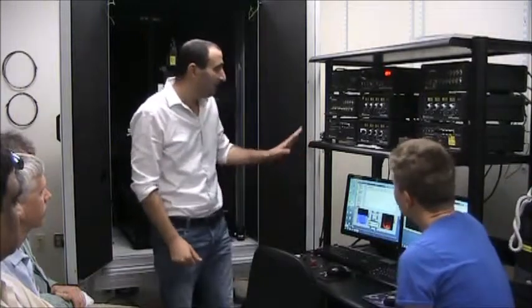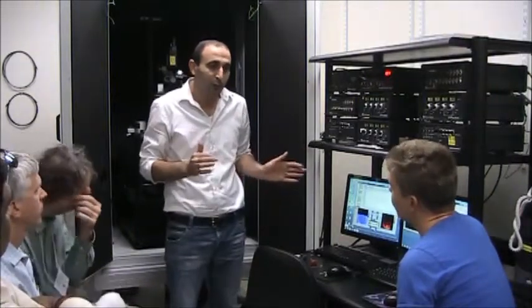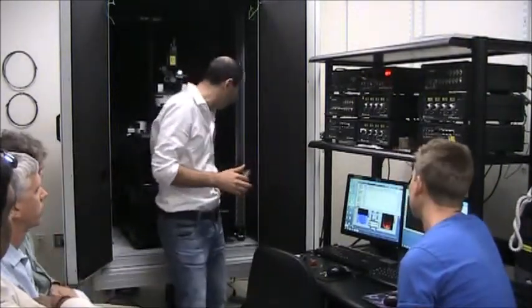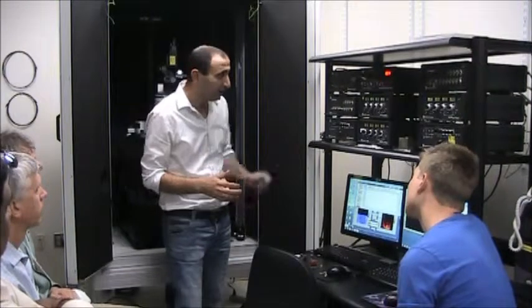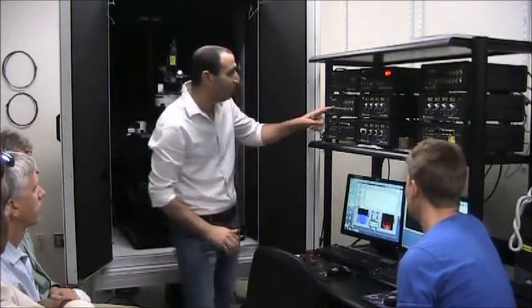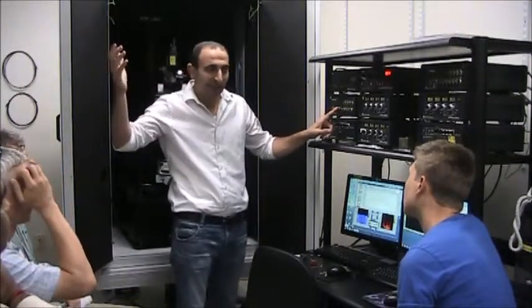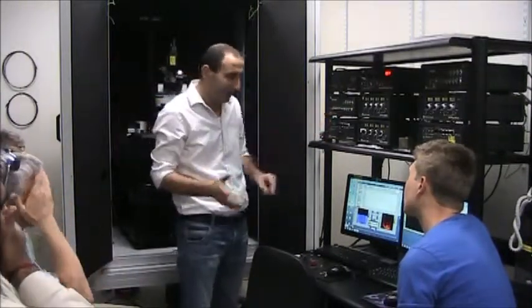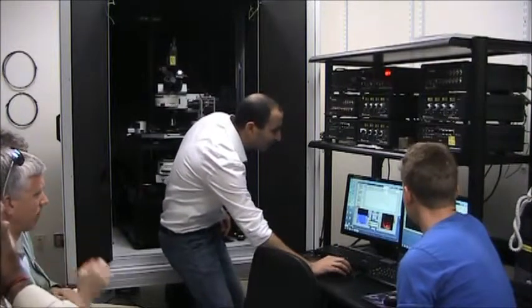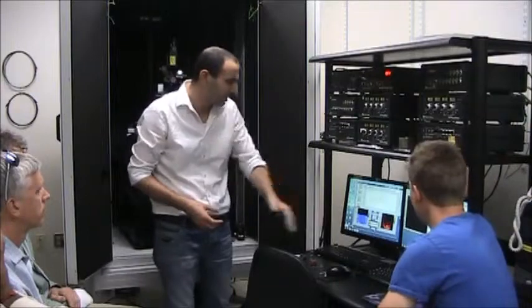Because the NSOM signal from the instrument, from the AFM perspective, is an AFM tip, it will give you topography images, and you take the signal from the detector and couple it to an auxiliary input here. So it will be synchronized with the AFM. In fact, you could couple other signals, like electrical signals or thermal analog signals, to the system, and you could choose up to 16 channels and monitor these simultaneously. Okay. So synchronized pixel by pixel.